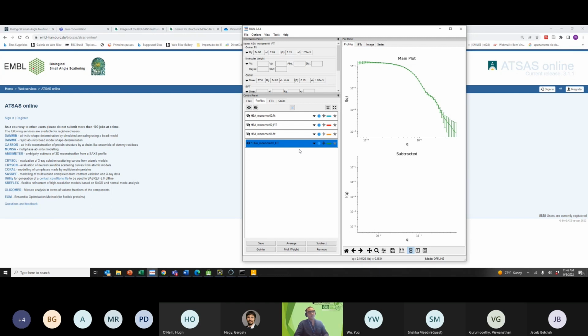So what I applied here was mostly for globular structures, but it also applies for disordered structures such as IDPs as well. There's a difference in how you properly analyze those types of data, but I think I pretty much covered the basics there for you to start the data analysis.